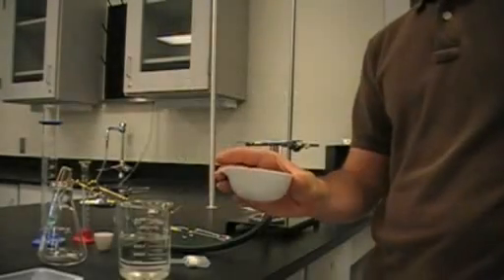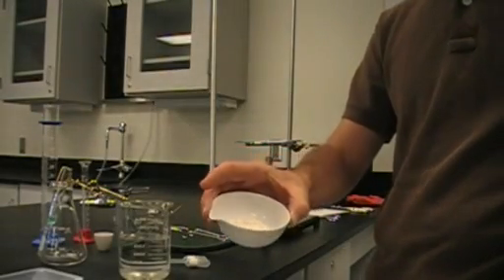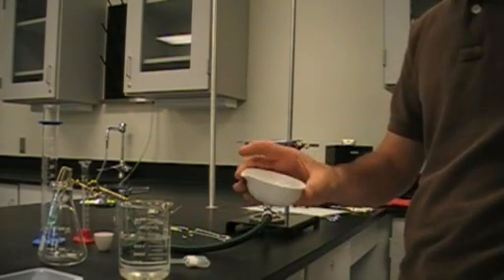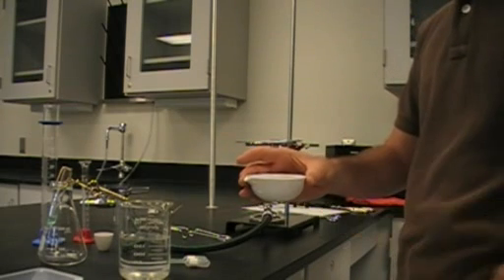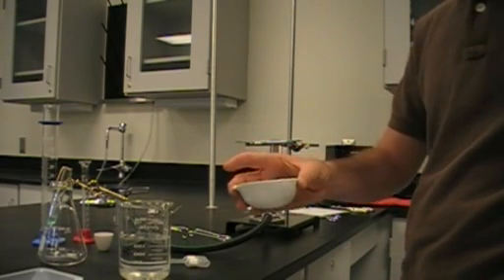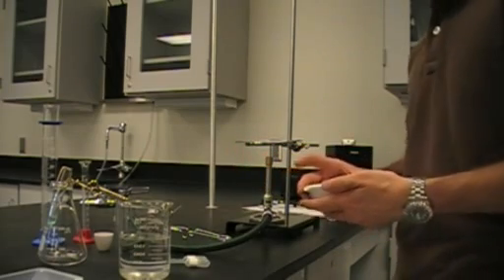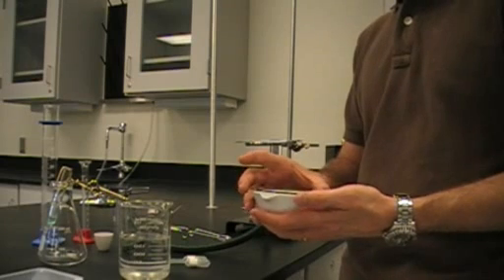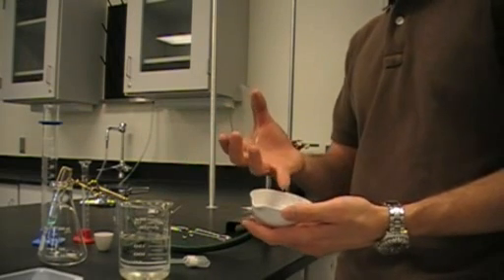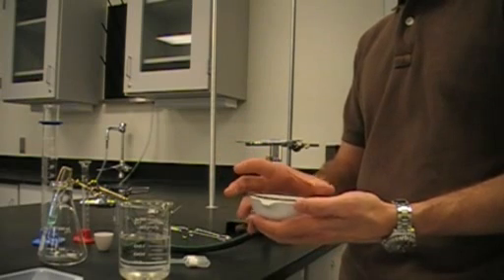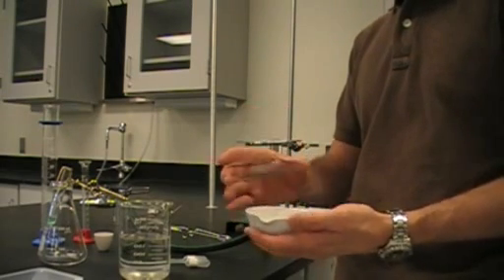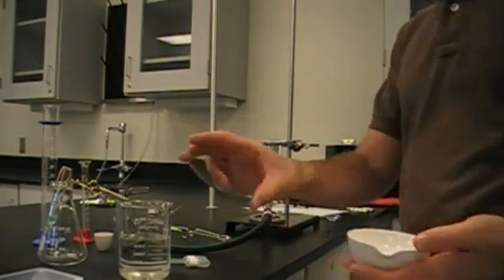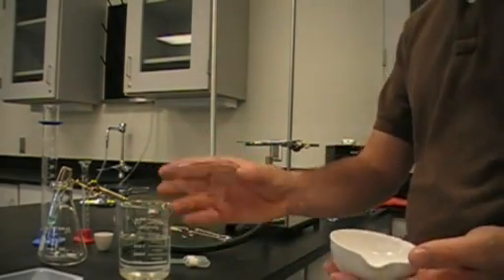All right, we are back from the fume hood. And this is what was cooking. It was a metal and I had some nitric acid. This is called an evaporating dish. Often times we will have some sort of liquid and we need to drive it off. So we are going to, in this case, boil the liquid out. If we had time to wait, we could evaporate the liquid out. But this is an evaporating dish. From time to time, this piece of equipment right here is a watch glass. It will sit on top of it just to prevent stuff from coming out. Sometimes it is important for us to weigh it before and after the water has been driven off. So this is just a way to make sure that the solid stays in. Whatever evaporates can still come out that little hole. In this case, we are not going to use the evaporating glass or the watch glass. But again, this is a watch glass. It will be on your assignment.